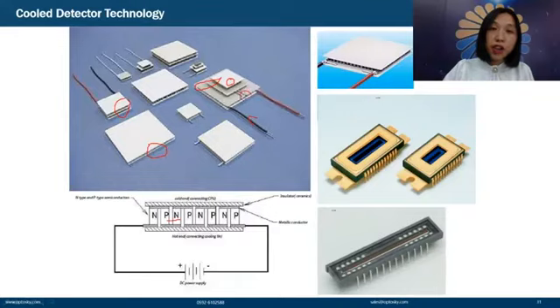So here is a heating port, and it can transfer the heat to the ventilation. Suppose we reverse the electric current from this side, then this side becomes heating, and this side we can make the cooling.